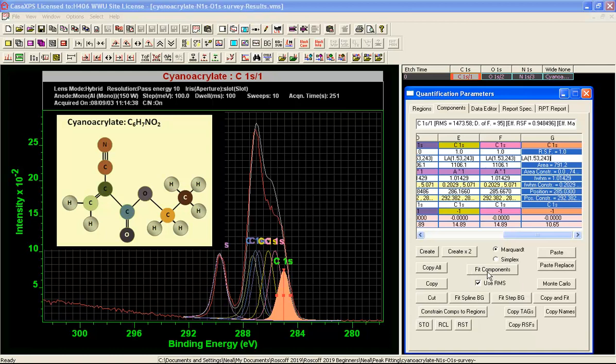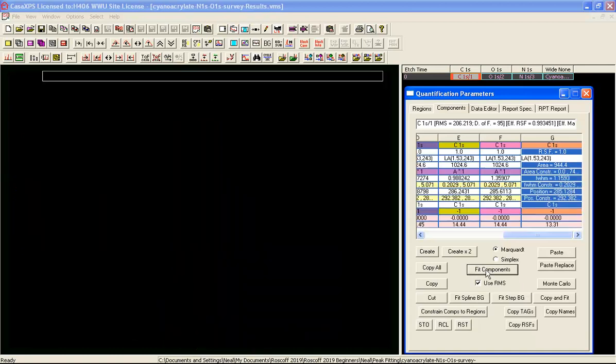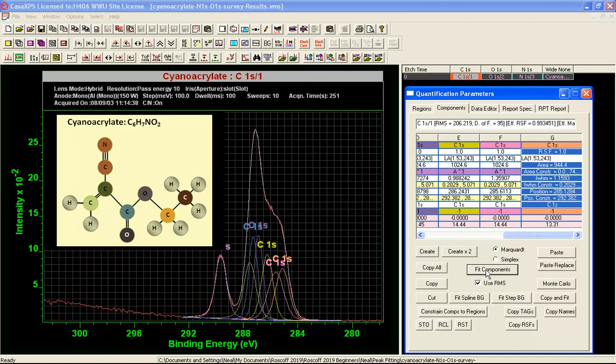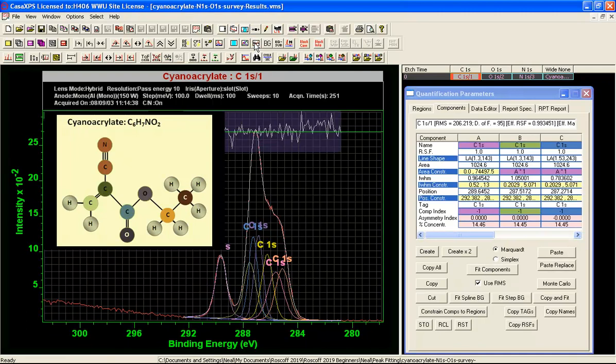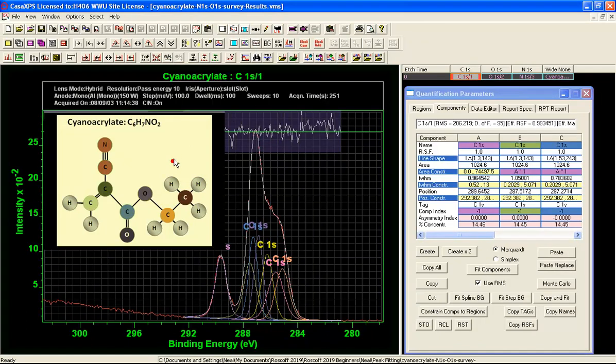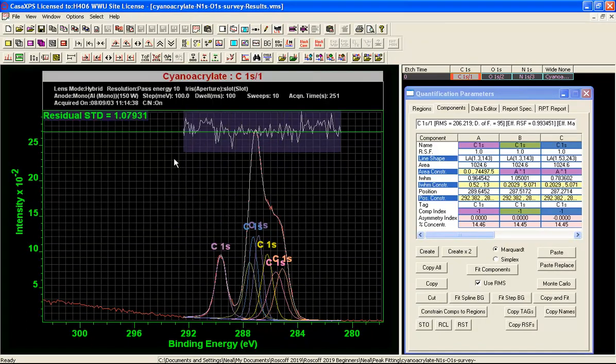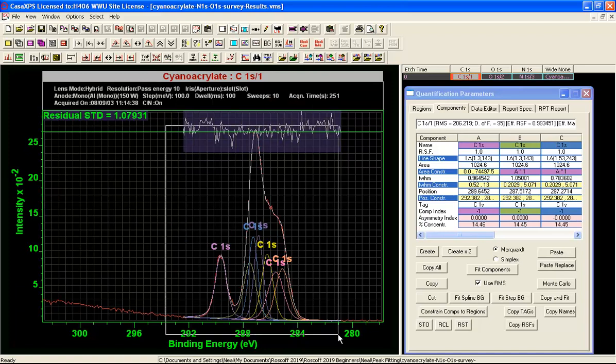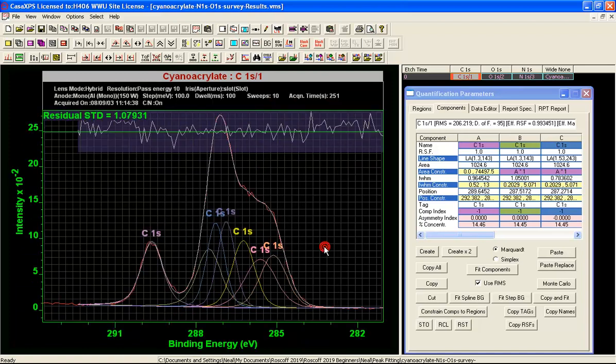So let's fit. And we end up with a peak fit. Put on a residual. We'll delete the inset tile.